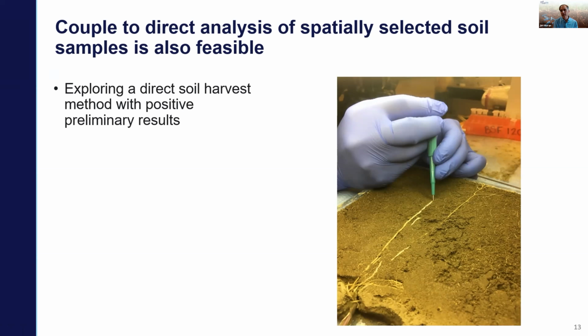It's not a non-destructive technique, right? We're actually physically removing soil, we're altering the system, but we're removing such a small amount that you could consider this approach conducive to time series sampling, right? Especially if you're willing to consider a time series where you sample in one location, and at the next time point you might sample 2 or 3 millimeters away from that along the root.